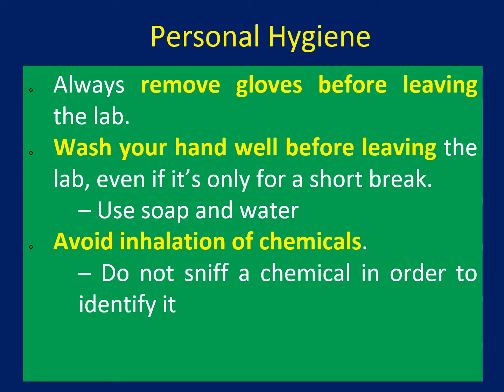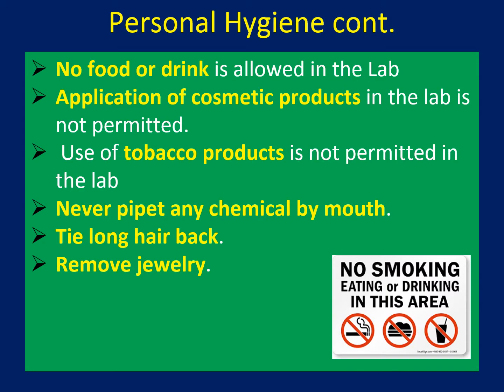And no food or drink is allowed inside the labs, and application of cosmetic products and using tobacco products is prohibited, and never pipette any chemicals by your mouth. And if you have long hair, please tie it up because it can catch fire, and remove jewelry because it can react with the chemicals.